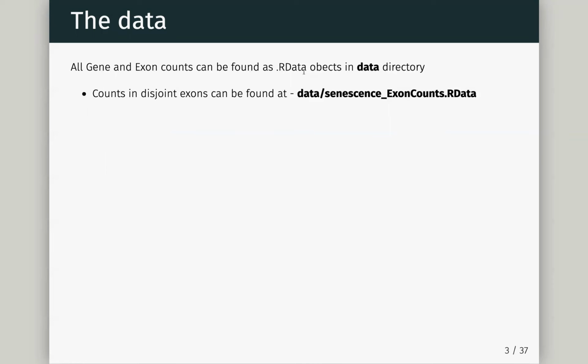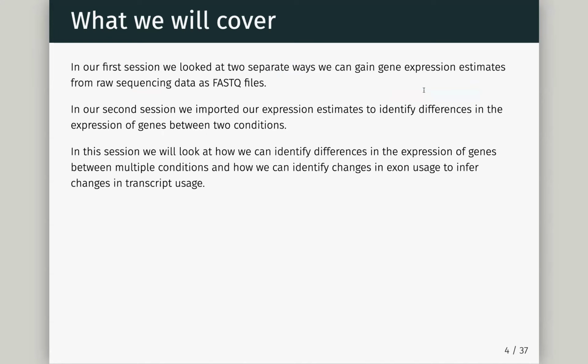So all the gene and exon counts I've already done. It takes a little while, right? So we have that in the R data directory. Sorry, in the data directory, you'll find data/senescence exon counts.r data if you want to follow along.